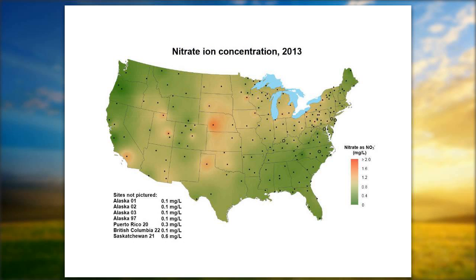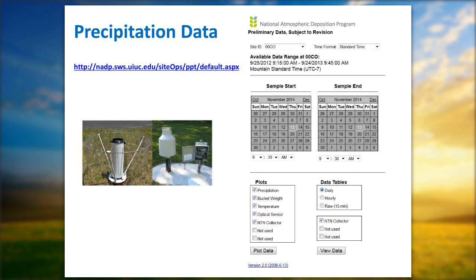What we really want to do is call our attention to the far right column, which is a completeness criteria, as Chris was talking about, for the amount of download of the sample. You see 100%, but then you may see the one column about halfway down, or 5 weeks down, that goes from 1024, that only has 39.58% of the completeness criteria.